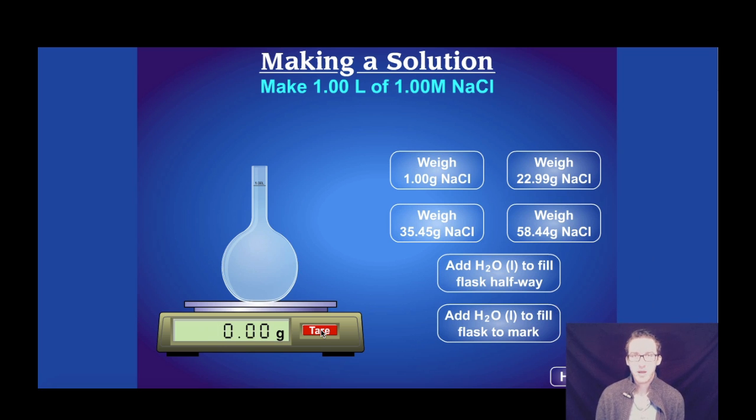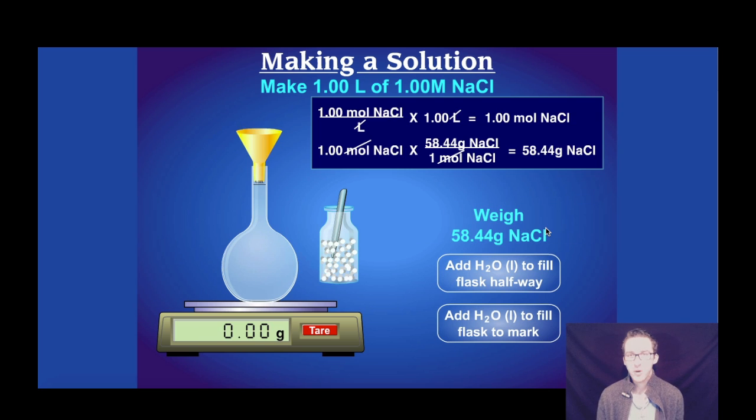And because I want a one molar solution of sodium chloride, I need one mole of sodium chloride. How do we know what the mass of one mole of sodium chloride is? We have to go to our periodic table. So we're going to mass out 58.44 grams of sodium chloride, which is the mass of one mole of sodium chloride.